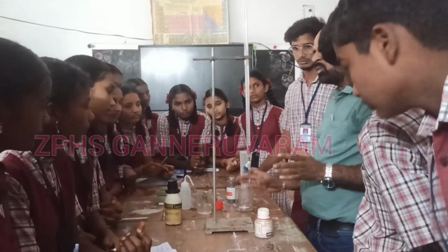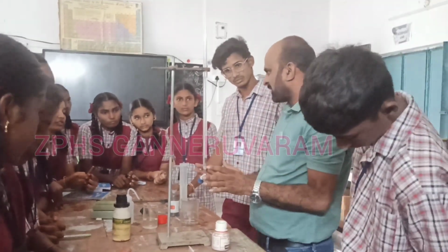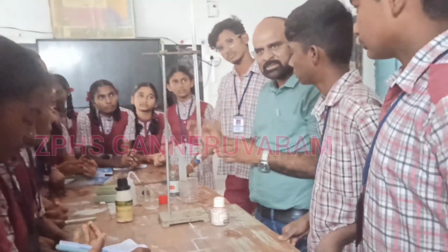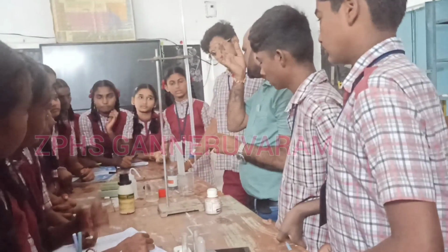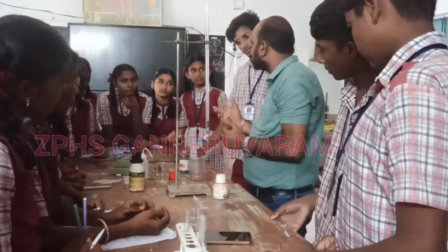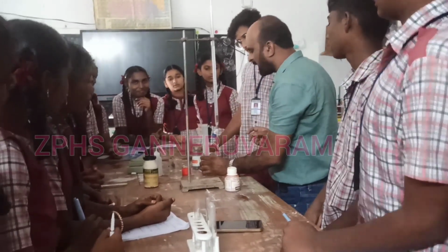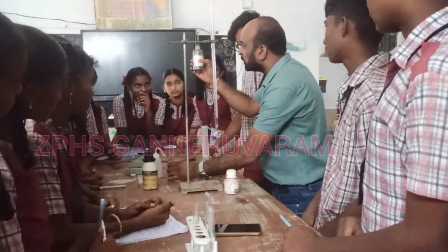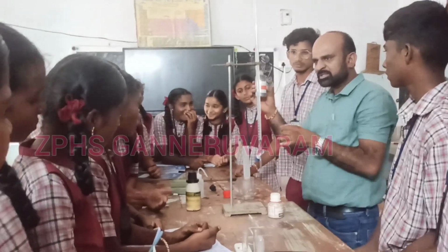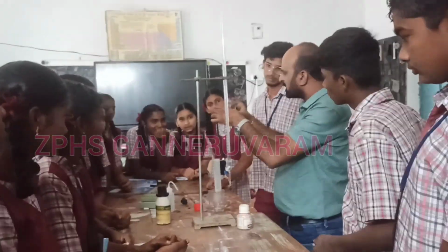So now I am doing the titration experiment, or neutralization experiment. How to do the neutralization experiment? By mixing the acid and base. How to know the neutralization reaction takes place? For that purpose, I am adding the red litmus solution to the base. This is the red litmus solution I have taken, and I am adding one drop to the base.